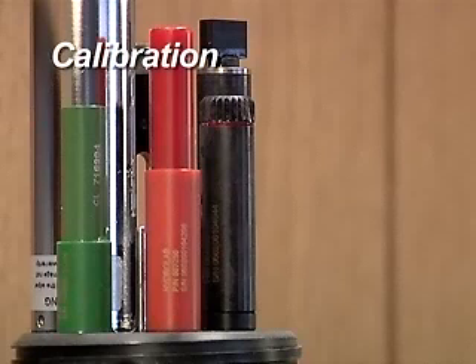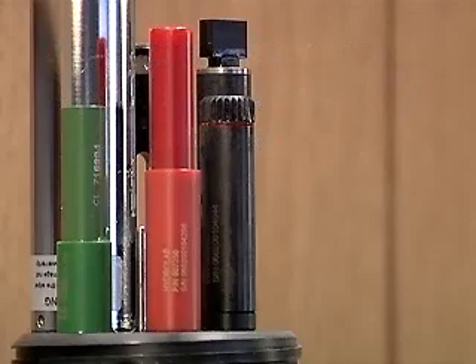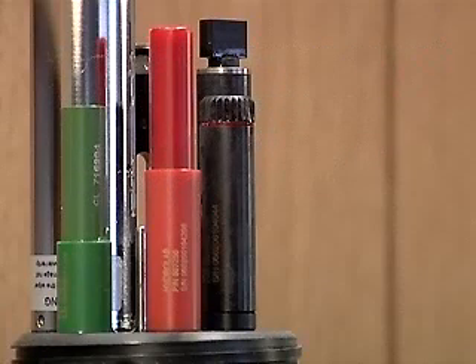Calibration. The ion activity in a solution is affected by the pH and conductivity of the solution. Prior to calibrating any of the ion sensors, the pH, ORP, and conductivity must be calibrated. If installing a replacement tip, the specific ion tip should be hydrated for 24 hours prior to calibration.